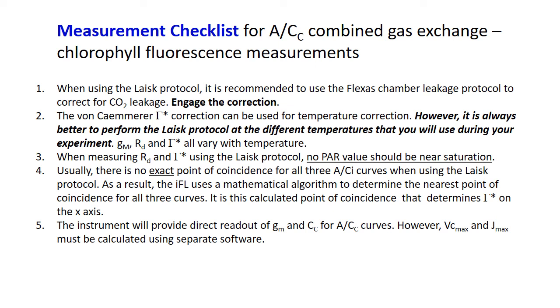Number 5, the instrument will provide direct readout of gm and Cc for A-Cc curves. However, Vcmax and Jmax must be calculated using separate software.